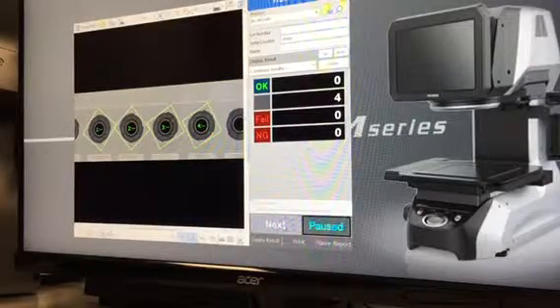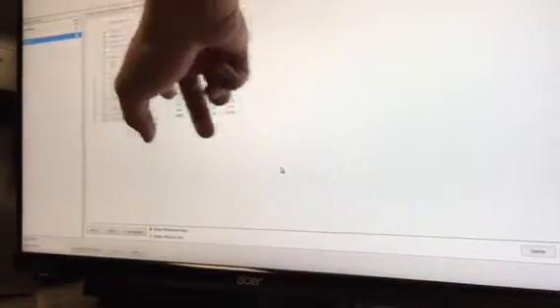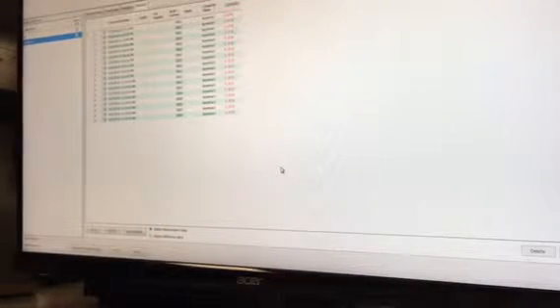Where's the data now for those two? Now the data is stored locally. Yeah, I set it to. That computer works now. I can't get back into the directories of this computer for some reason. I need to dig into that again. So now we see, 523, 1, 2, 3, 4, 5, 6, 7, 8.